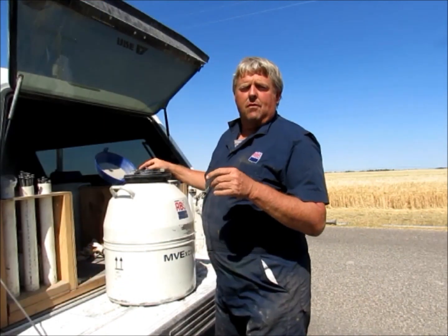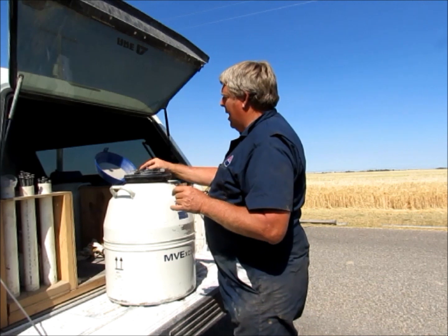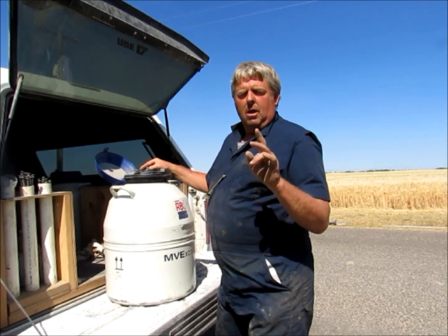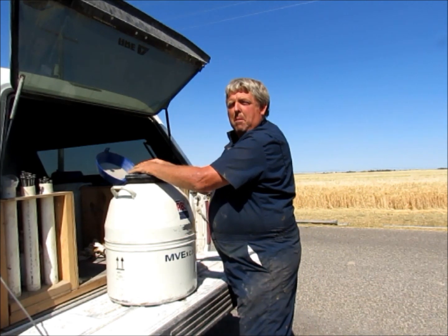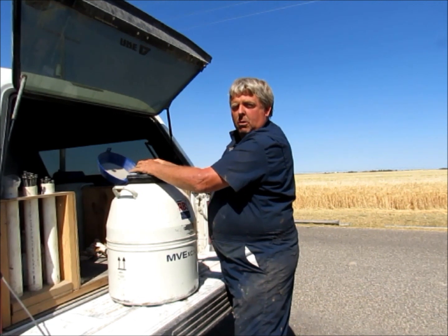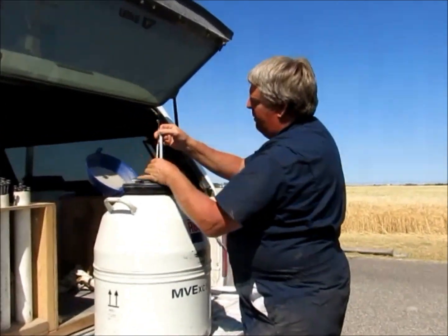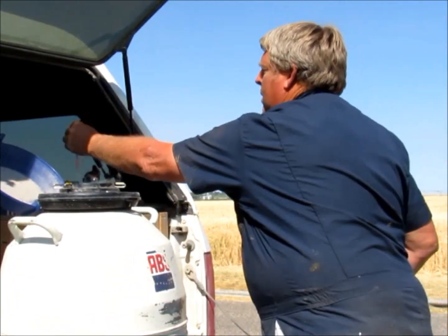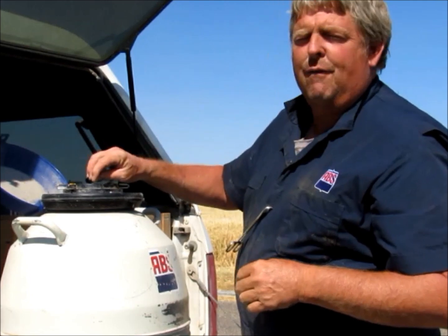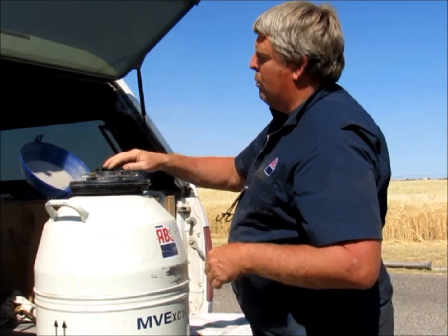It's three days after we gave them the shot of lutelyse and pulled the CIDR. Both of them are in heat. I'm going to take both units of semen out to the cow. We store it in liquid nitrogen, which is minus 320 degrees. They're held in racks that hold 10 units, in straws. We put them in warm water at about 95 degrees and leave them in there for about 30 seconds, then we'll go breed the cow.